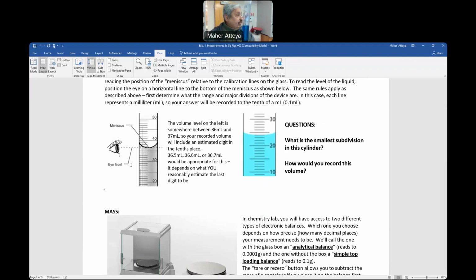Okay, and there will always be an error when it comes to estimating in between the scales. So, for example, this is 58. Now it is 58. However, then you have to estimate in between. I will give it 58.50. So 58 and 0.5. 0.5 is an error. 0.50 is an error.